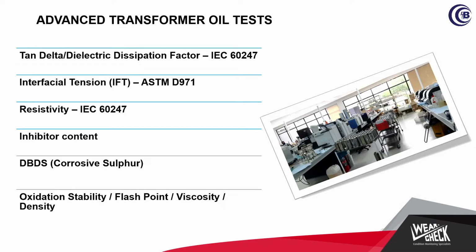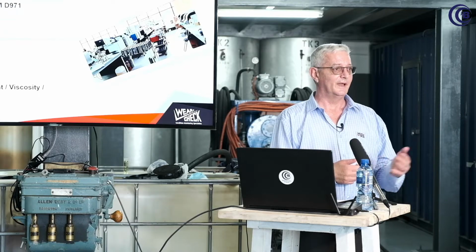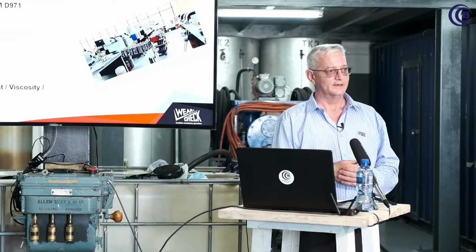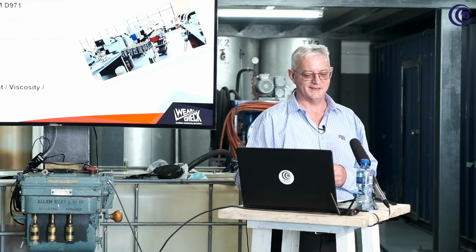Now, flashpoint, viscosity and density, that I will put in a specialist test category. There should be reasons why you want to do those 3 tests. That shouldn't be even on a yearly basis. There should be a specific reason why you want to do that, maybe some contamination that you're looking for. Here in Cape Town, a municipality here had a paraffin problem where, I don't know if they stole it, but in their main supply tanks, paraffin was added. And that was added to one of the 20 MVA transformers. So when you get that sort of problem in your transformers, then you need to start looking at these special tests.